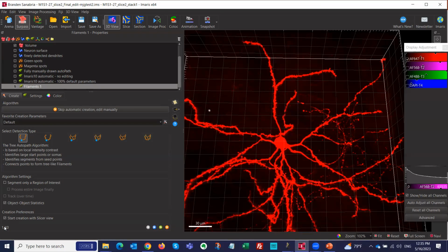And using machine learning in the wizard, we want to remove those post creation steps, because all those post creation steps are not batchable, because everything you do manually, you cannot batch from it. Now, if you use machine learning tools to mitigate those in the wizard, you can batch process it, meaning you can finish this and apply it to 100 images and it will work with the machine learning, okay? So I'm going to go to the next step.